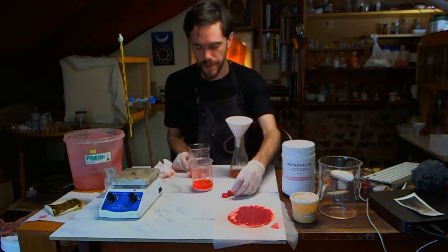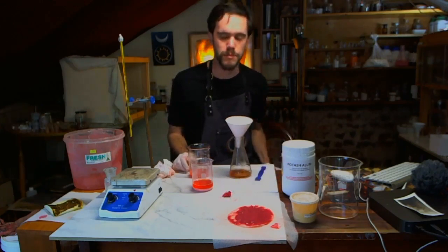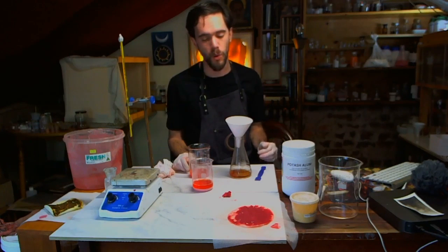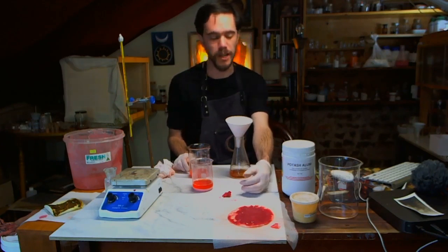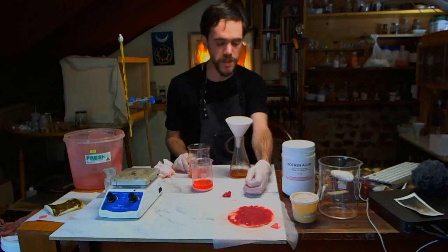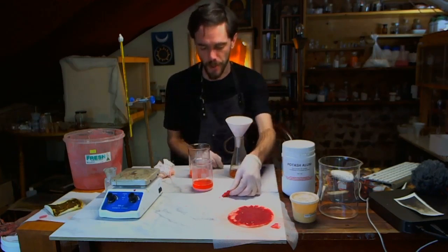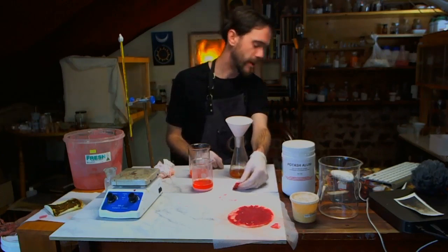That's a good point. Yes, I could recover this by dissolving the cotton wool. What would I dissolve the cotton wool in that wouldn't damage the pigment? Well, actually, we can dissolve the pigment. I think the pigment will dissolve in hydrochloric acid, if I'm not mistaken. So maybe if we just dissolve the pigment and leave the cotton wool. Or actually, I can just probably rinse this in water. That'll probably also work.